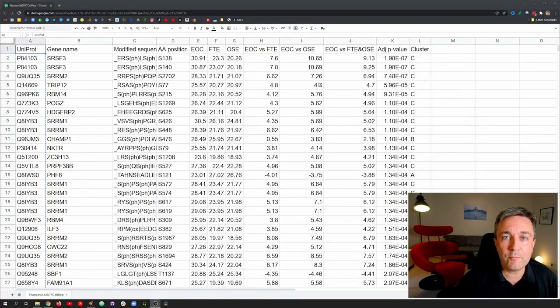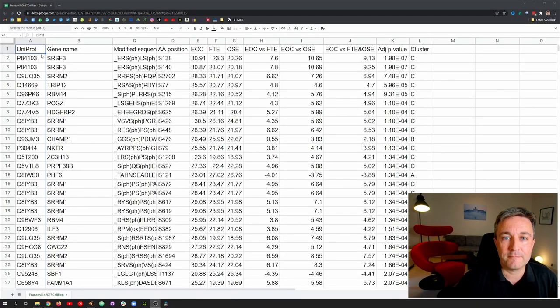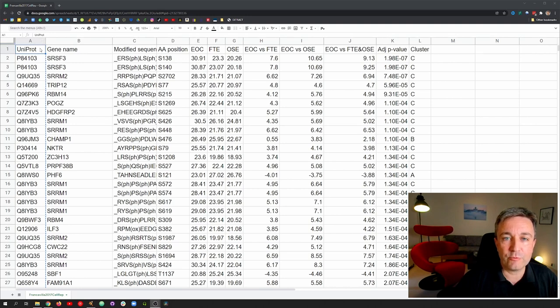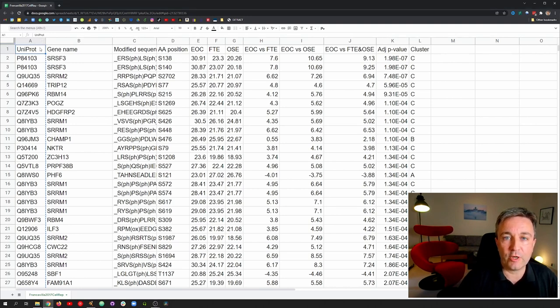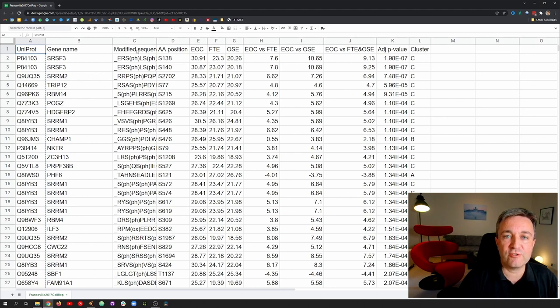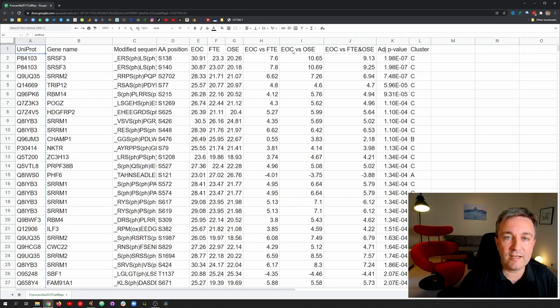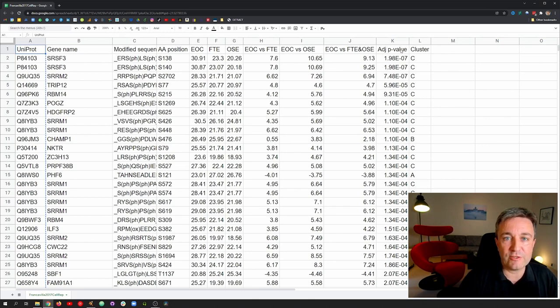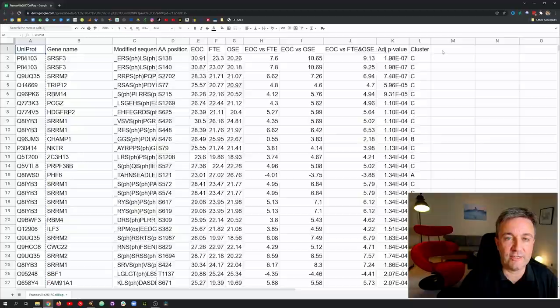This time, we'll work with a large phosphoproteomics data set. Each row in this spreadsheet represents a phosphorylation site with a uniproduct session number for the protein, a gene name, the modified residue number, multiple log-fold change values representing comparisons across several conditions, and finally, a cluster assignment that summarizes the behavior across all the conditions for each site.